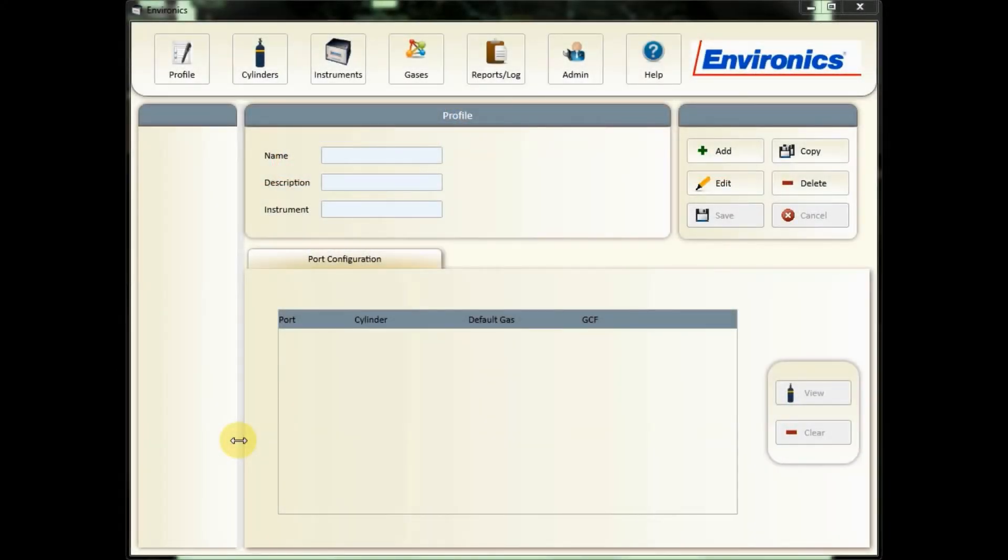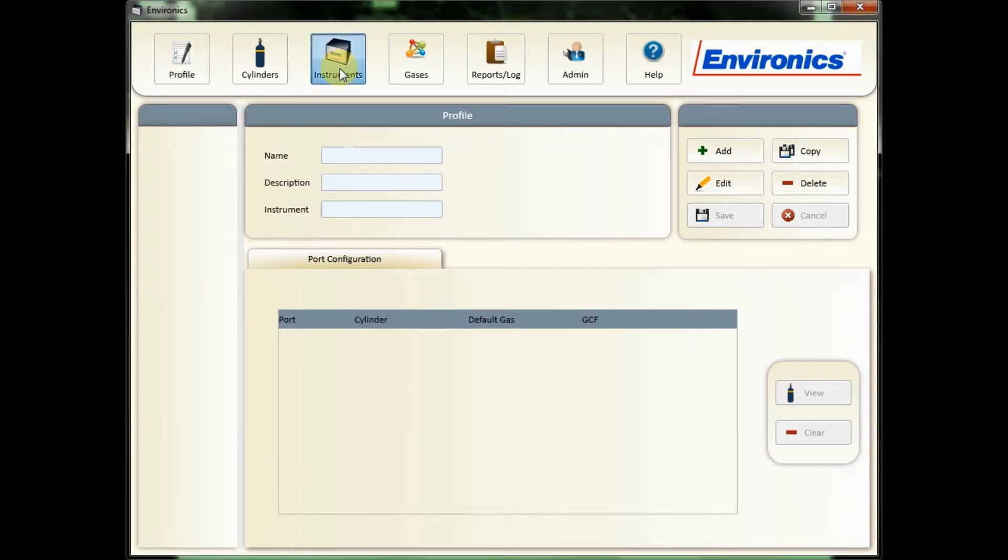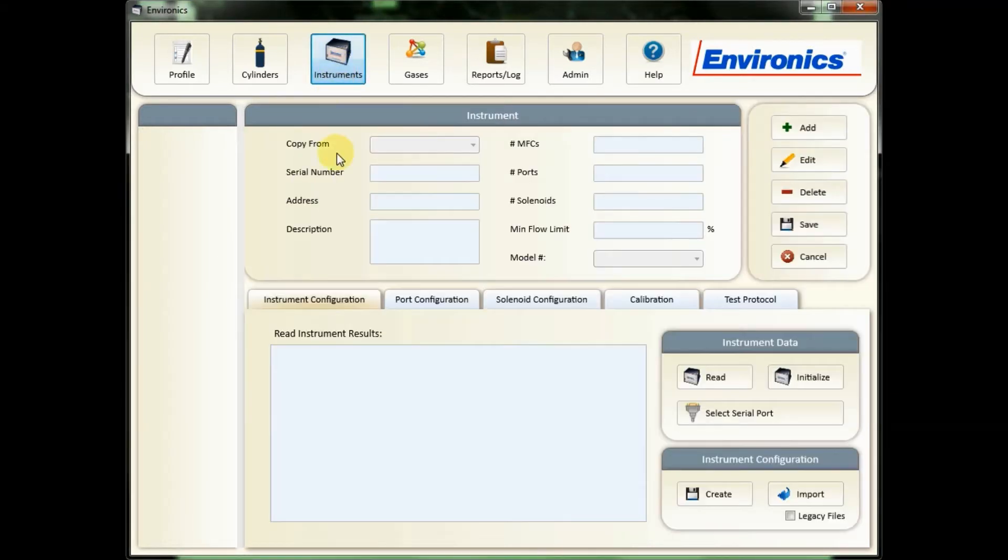When you open your Environics software you will see this profile screen, but first you're going to go to your instrument tab and that's where you'll actually import the data.